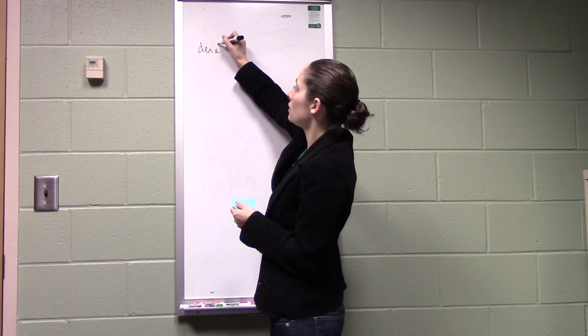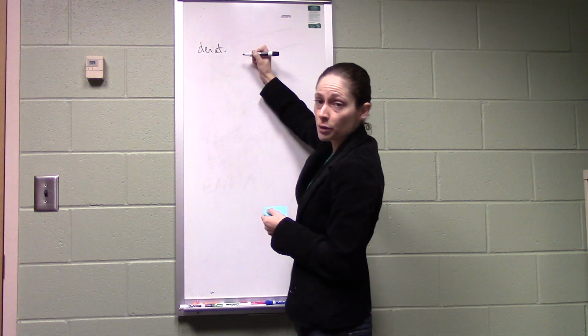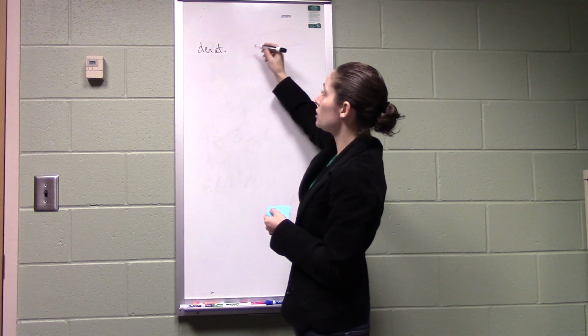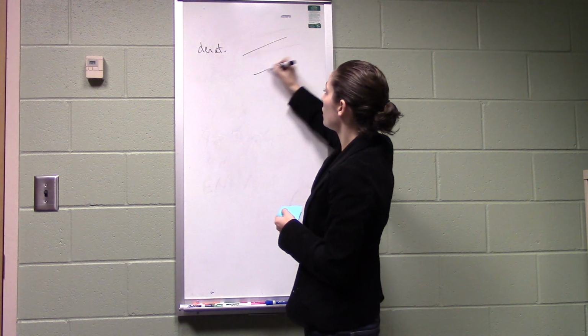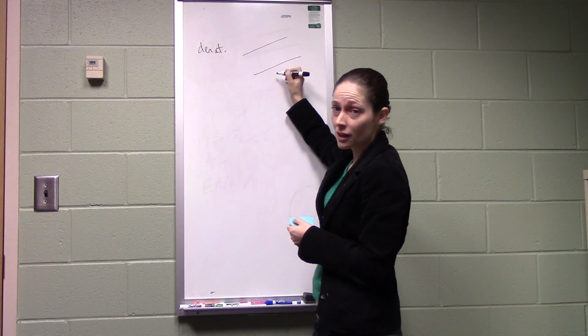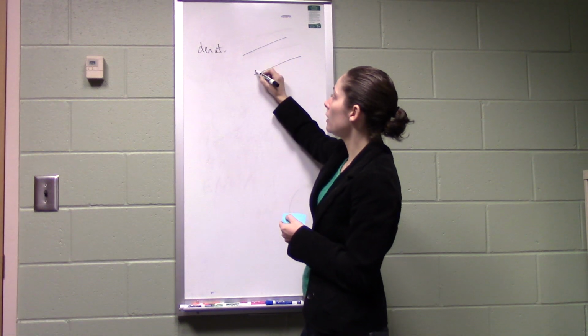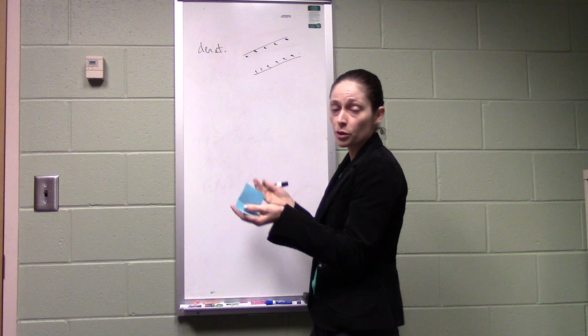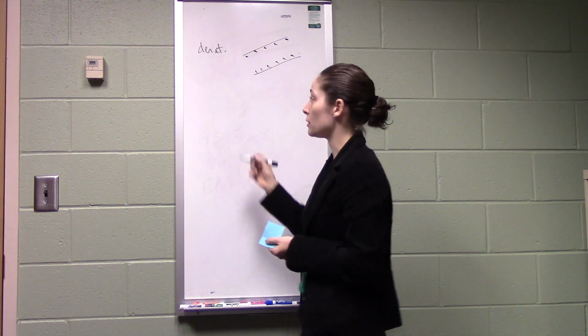So you first denature your template, right? So you have double-stranded template DNA that you put into a PCR reaction. You denature by heating to 95 degrees, so pretty hot, and your strands now separate from each other, exposing their bases so they can base pair with something else.